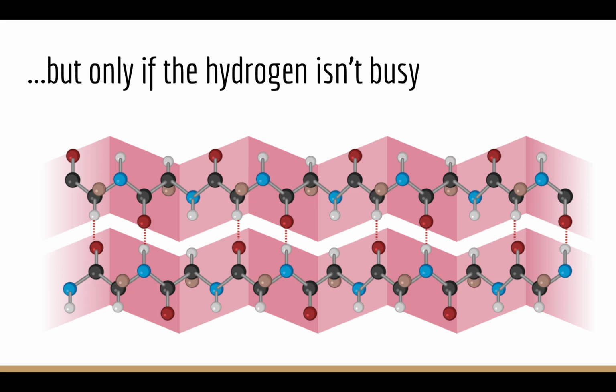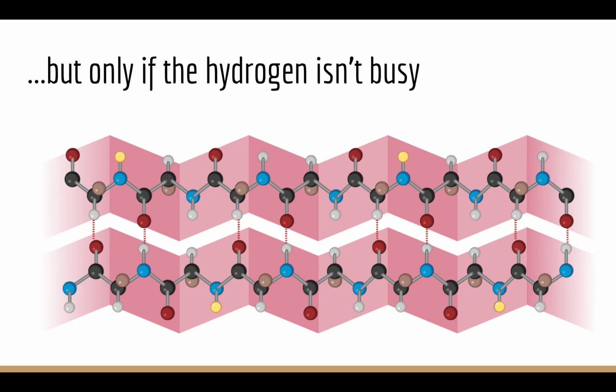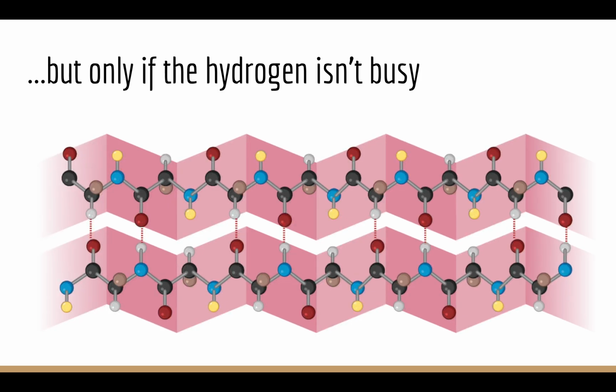This only happens if the hydrogen already isn't busy. We see here that the most accessible hydrogens exchange, then most of the hydrogens exchange, but we don't see the ones that are already interacting with the neighbors, the ones that are buried, or the ones that are very rigid.